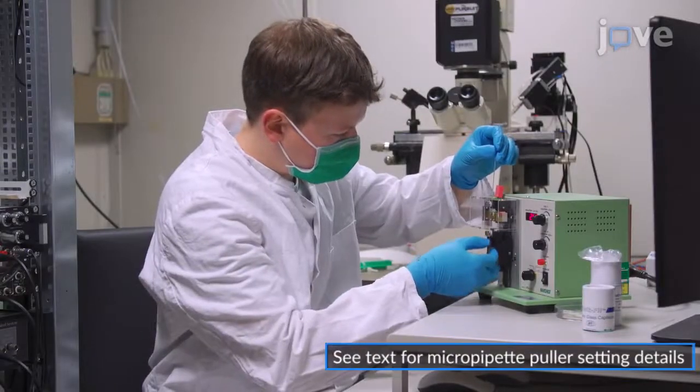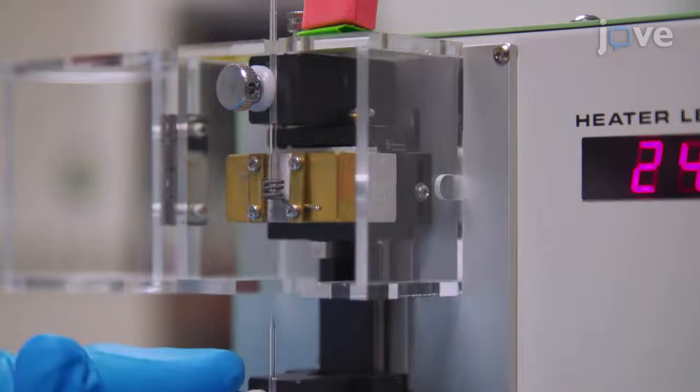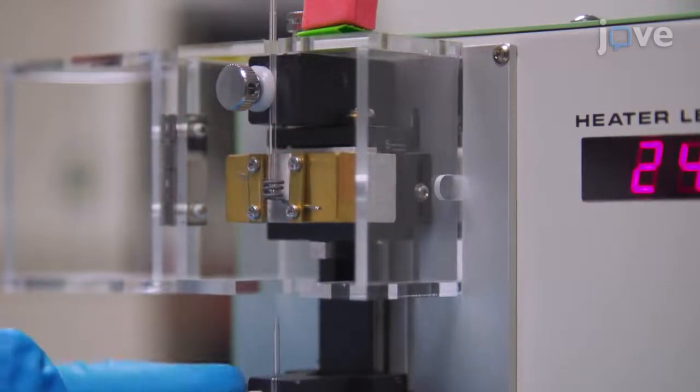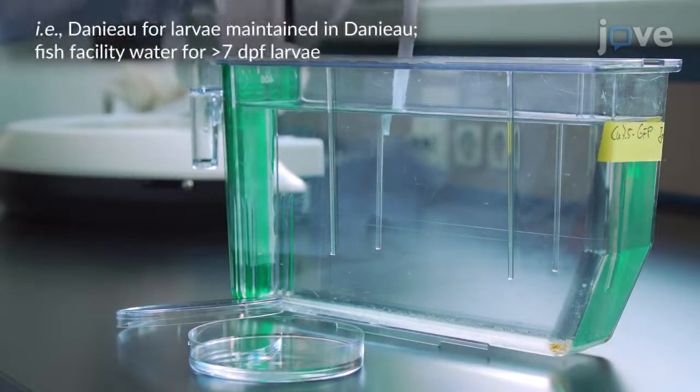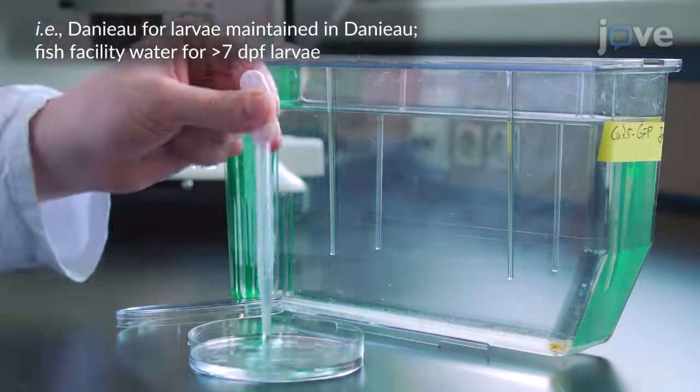Before beginning the experiment, use a micropipette puller to prepare sharp thin glass needles from glass capillaries. Next, use a plastic pasteur pipette to collect larvae into a 90mm diameter petri dish containing the appropriate solution.